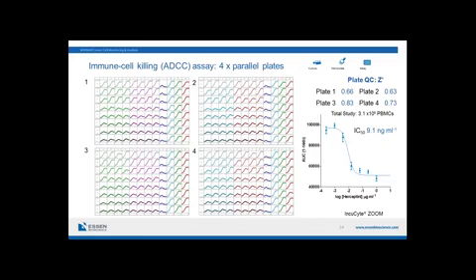And I just show you one representative concentration response curve here for Herceptin to illustrate how this approach can be turned at scale into robust quantitative pharmacology.